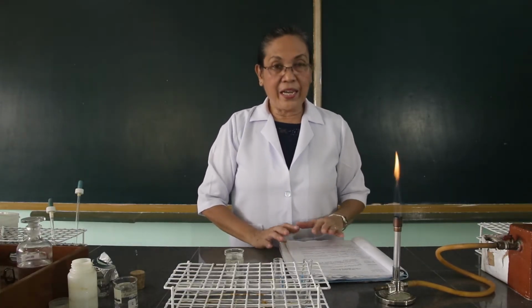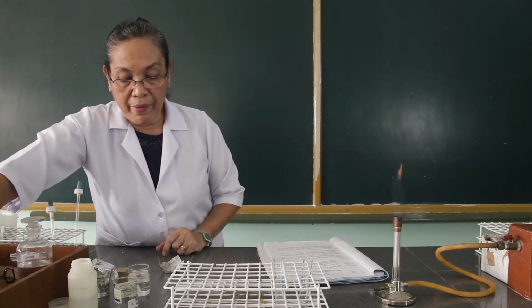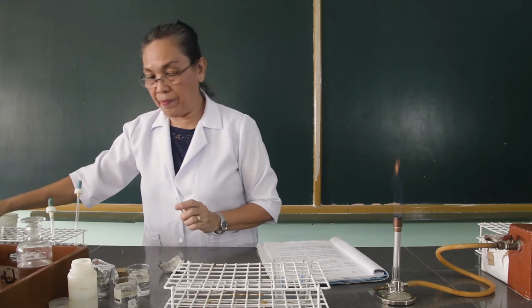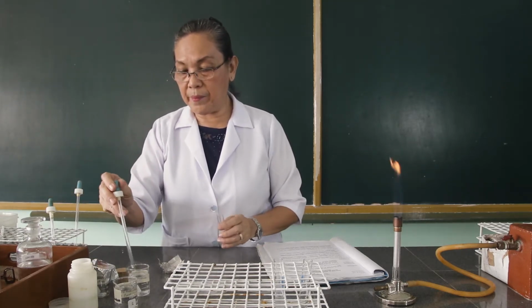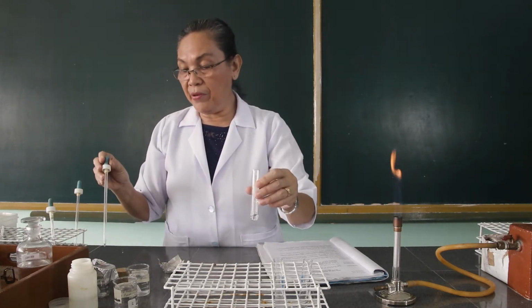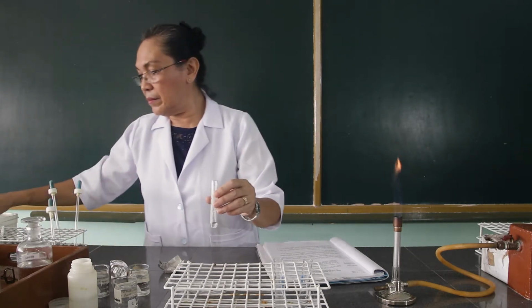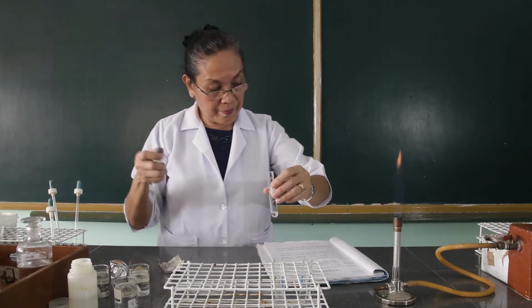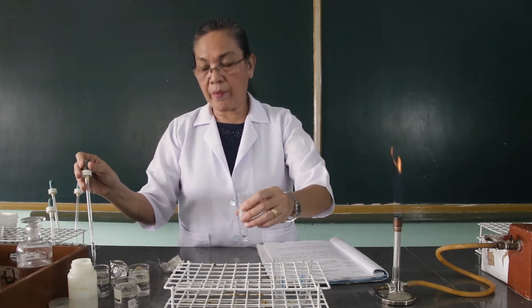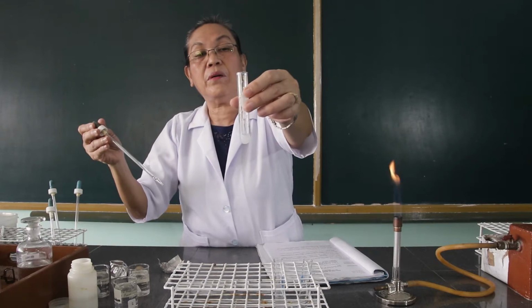Then we're going to test the ion barium. Instead of magnesium chloride, this time we're going to use the barium chloride. So this time, let's get 1 ml of the barium chloride. Then let's add this with ammonium carbonate. Two drops. 1, 2. Observe what happens.